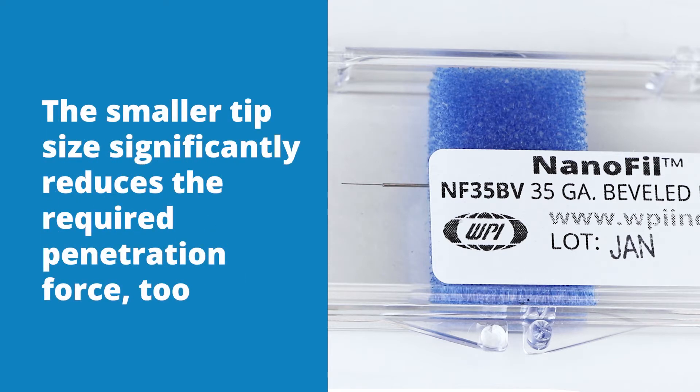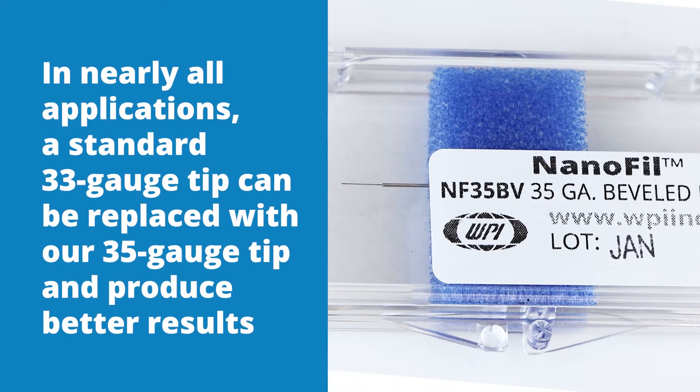The smaller size tip significantly reduces the required penetration force too. In nearly all applications, a standard 33 gauge tip can be replaced with our 35 gauge tip and produce better results.